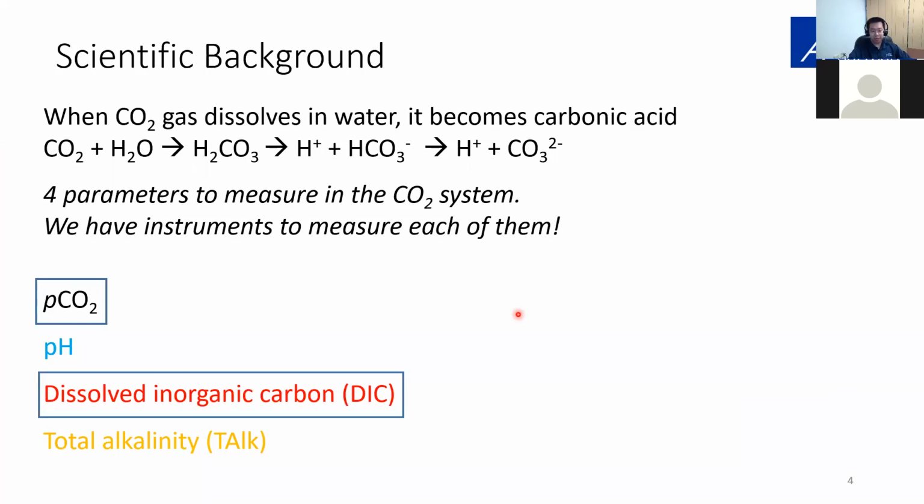The pCO2 system measures the carbon dioxide that dissolves in the water sample by measuring the CO2 concentration in the air that's equilibrated with the water sample. And the DIC analyzer uses phosphoric acid to convert all the carbonate and bicarbonate to CO2, and then extracts everything with a carrier gas. In both cases, our equipment processes the water sample to extract the CO2 and send the gas sample to LI-COR analyzers to get the CO2 concentration readings.